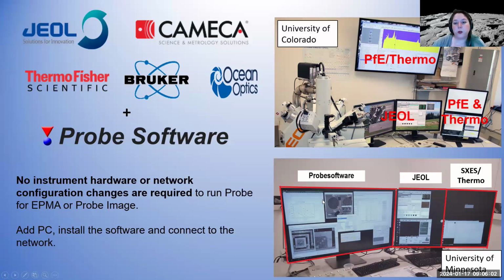We have two main microprobe vendors. Okay, so now you can see my mouse pointer better. So we usually deal with either JEOL microprobes or Cameca microprobes. We might have some additional detectors. And so usually these instruments come with their own dedicated software. That software is often quite capable for a lot of things, but specifically in a university environment, there can be limitations. And so I often like it, like we buy these $2 million instruments.